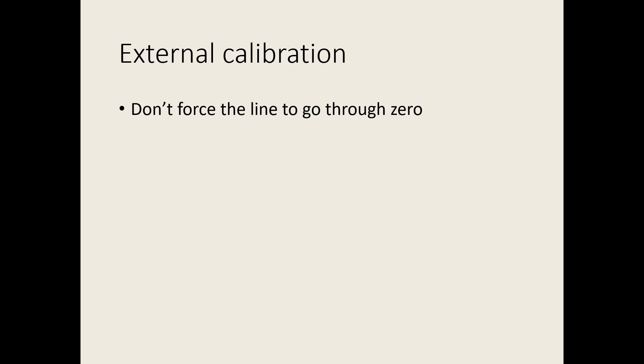The line should only fit the points you have measured, so you shouldn't force the regression line to go through zero. Most analytical techniques have a level of background response even when the concentration is zero. If you force the line through the origin, you'll get a distorted value of the slope and therefore an inaccurate value for the concentration.